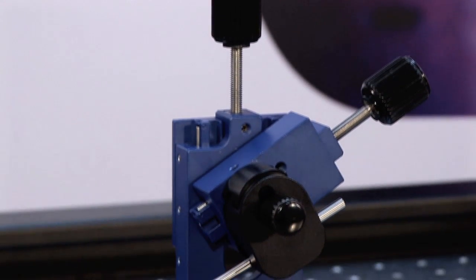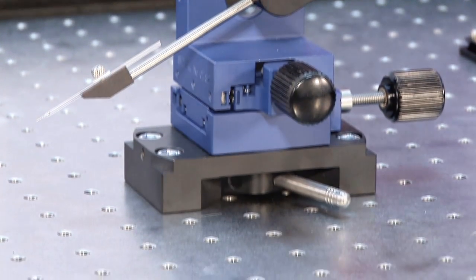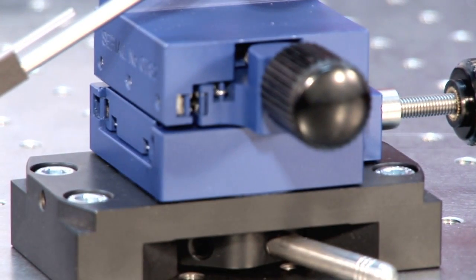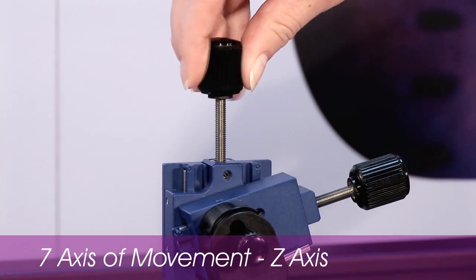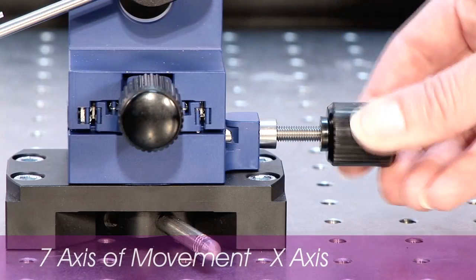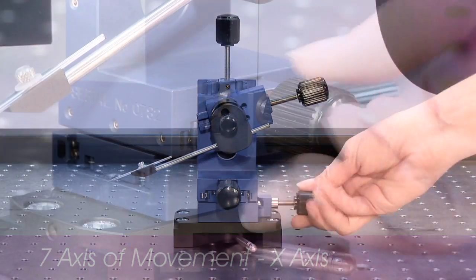The LBM7 Manual Manipulator was designed and developed in conjunction with scientists to achieve absolute practicality, accuracy and increased productivity, bridging the gap between coarse manipulators and micro manipulators. The LBM7 has seven axes of movement — four linear and three rotational. This, combined with a one micron resolution, provides a complete positioning tool for a range of applications.